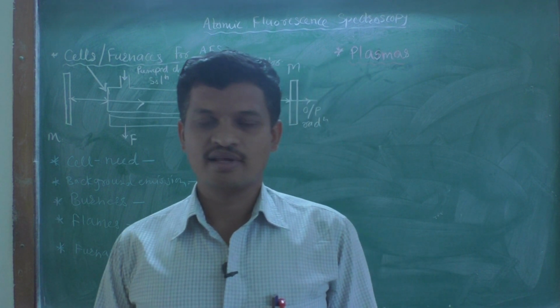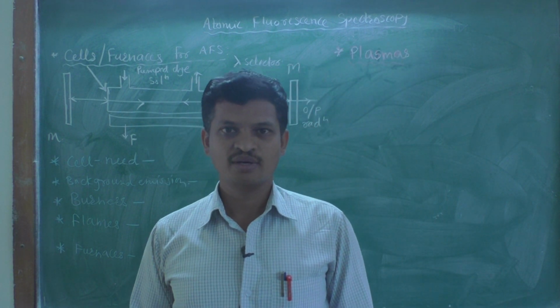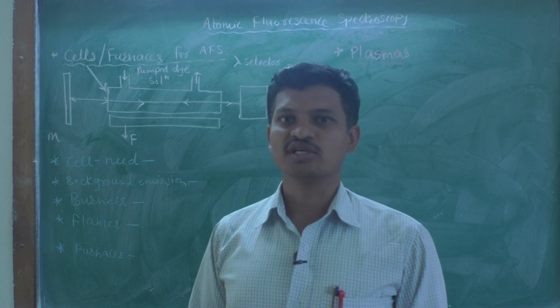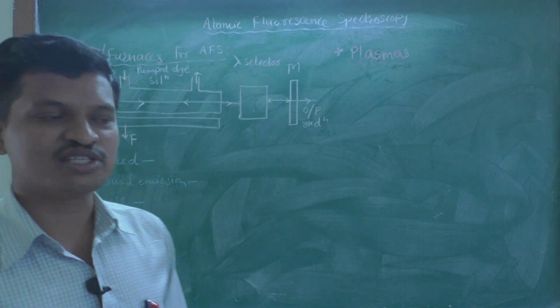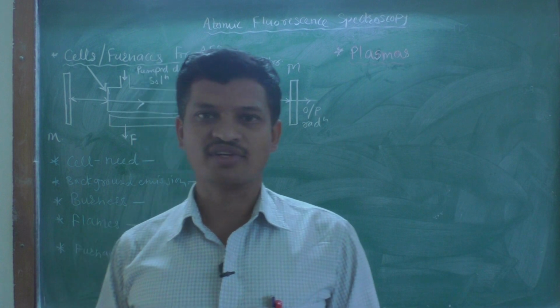Today we are going to see the details about cells or furnaces, that is, the sample holders used in an atomic fluorescence spectrometer. So what is the need of these cells or sample holders in AFS?